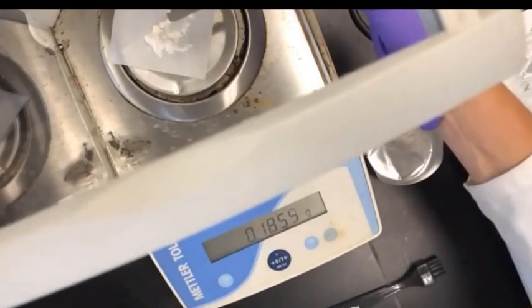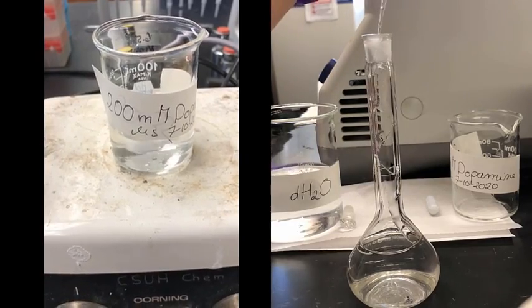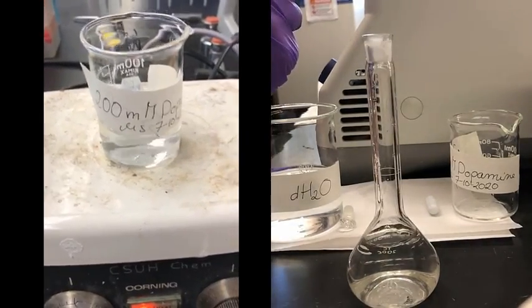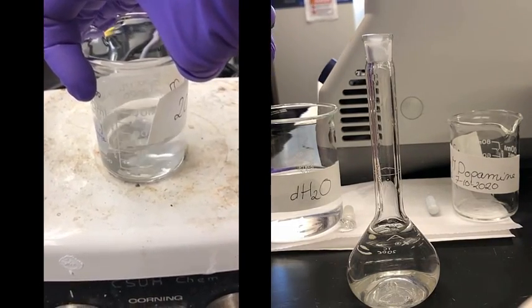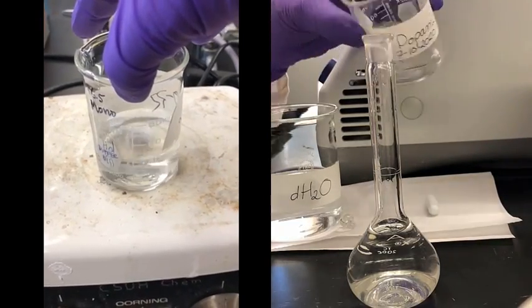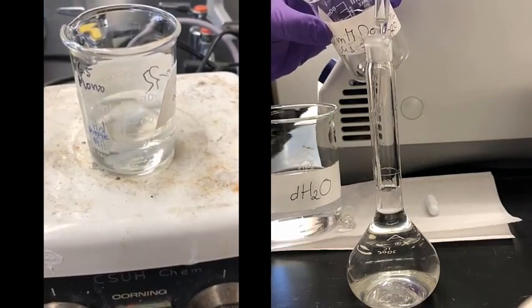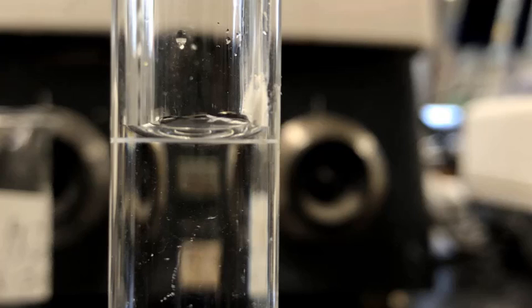In this first preparation method, I'm dissolving the solid dopamine hydrochloride in distilled water, and then I'm transferring it into the volumetric flask. This method is useful if you're not sure how soluble your compound is and you really want to stir with a magnetic stirrer. Then you have an additional beaker, so you need to rinse a few times through the beaker. Here I'm showing you the meniscus of the volumetric flask to get the volume as accurate as possible.